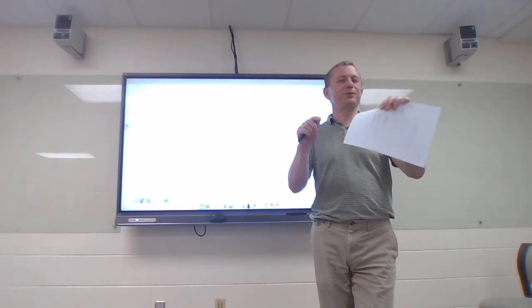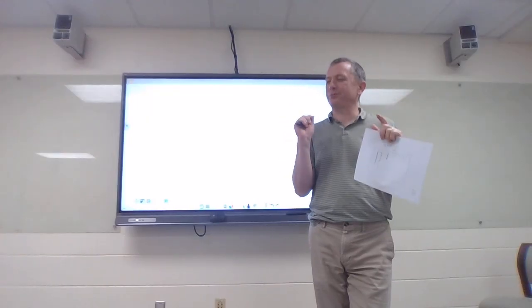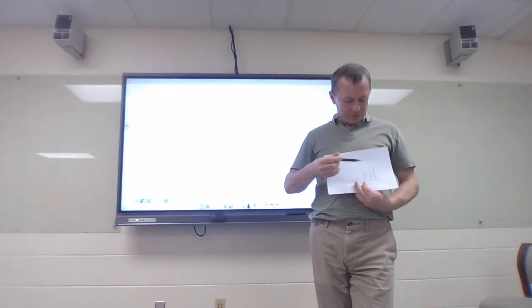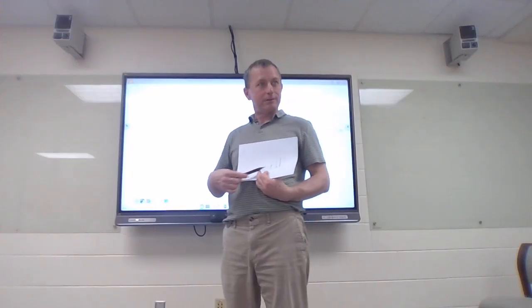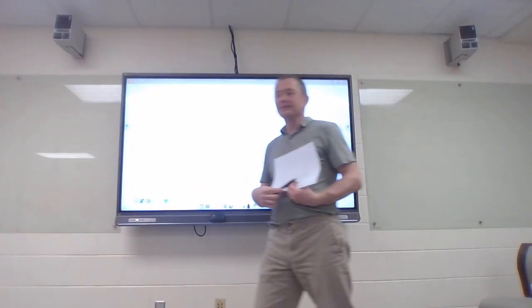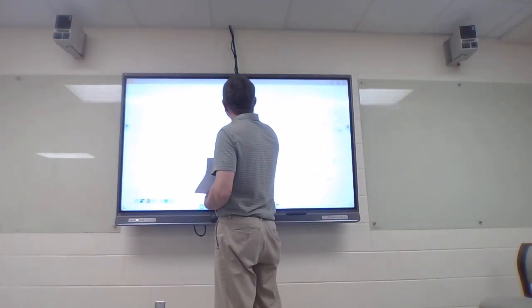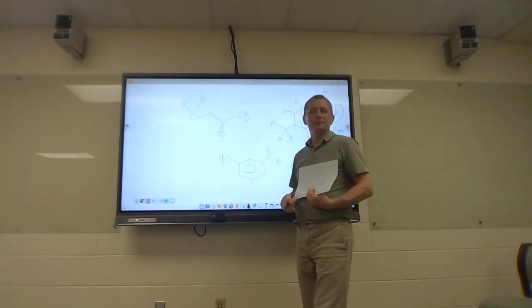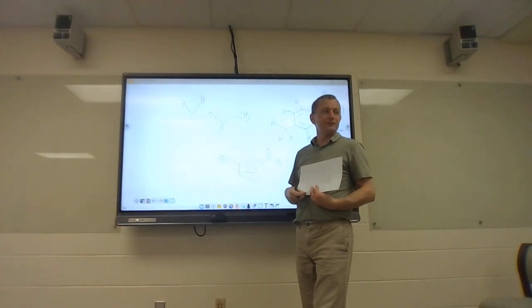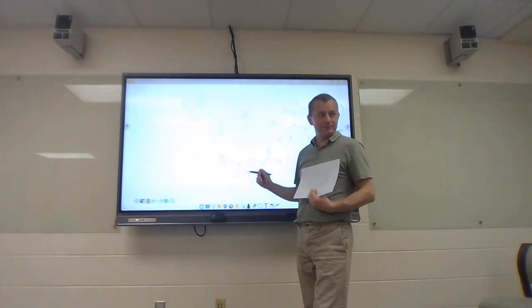Or do you have 2 things? You have a peak integrating to 1 and a peak integrating to 3. So maybe you can now start to see you've got a singlet in the middle of more peaks, and that singlet's probably 3. It's around 2. Hydrogens on a carbon next to a carbonyl. Yeah?